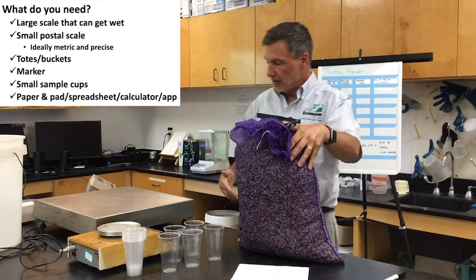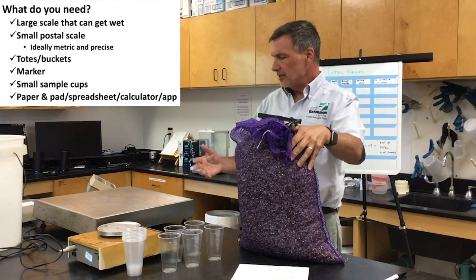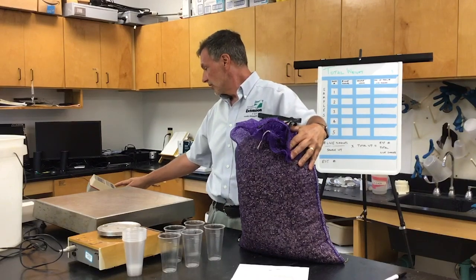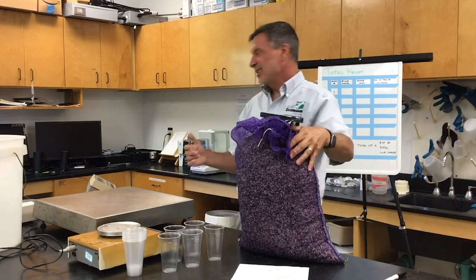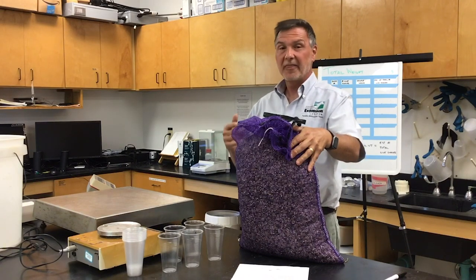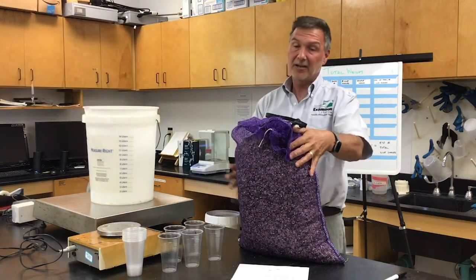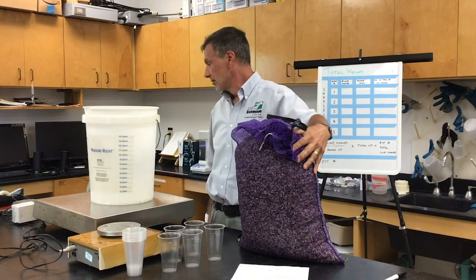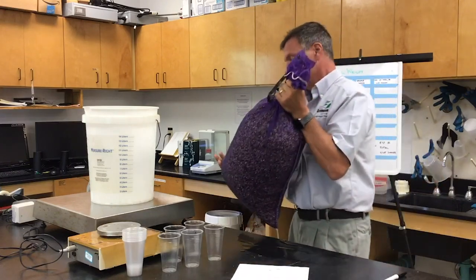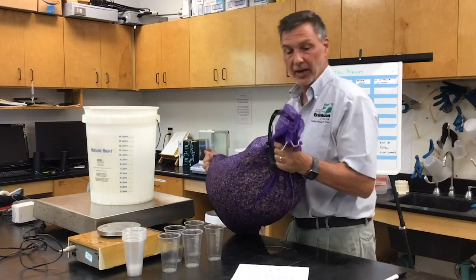I'm going to turn on this large scale. This is a scale that can get wet, but you can use any large scale — just be careful about how precise it is. I'm going to convert this to metric, so it's going to be in kilograms, going out to thousandths of a kilogram. These seed are not going to fit in one bucket, so I'm going to zero out this bucket. One mistake you can make: there's some water in this, and I don't want to weigh the water because it's not part of the weight of the seed.